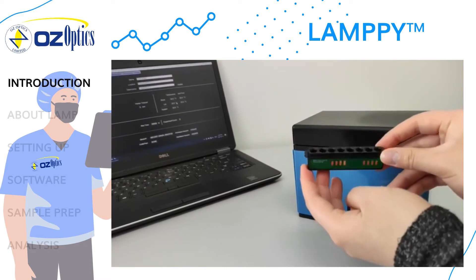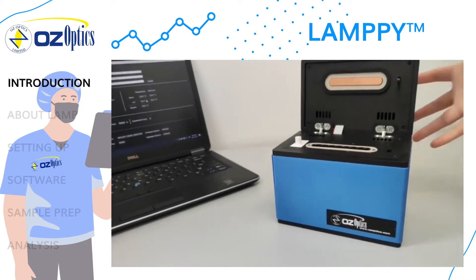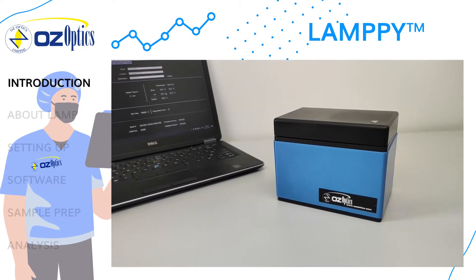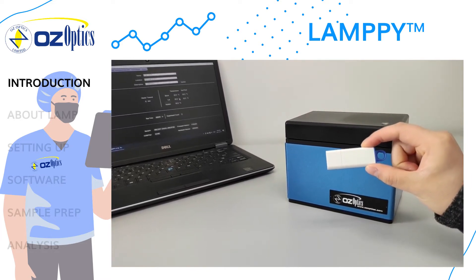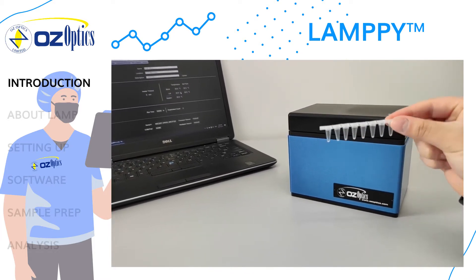Introducing Lampi, an affordable and reliable instrument that is ready to go out of the box. You will be provided with a Lampi instrument, a filter block already installed, a power adapter, a USB cable, a flash drive with the install software and the user manual. You can also choose to purchase 0.1 milliliter low profile tube strips and caps to get started right away.